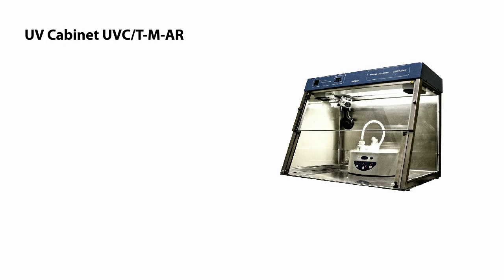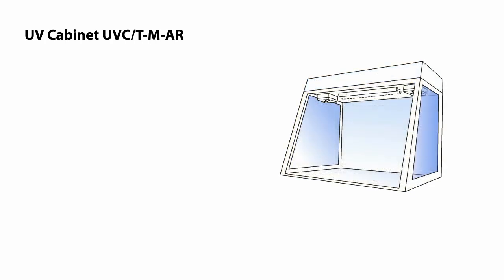In this video features Biosense very own UV cabinet UV-CTM AR, the one with glass walls and steel back wall. Cabinet has got an air circulator with closed UV lamp and an open UV lamp.